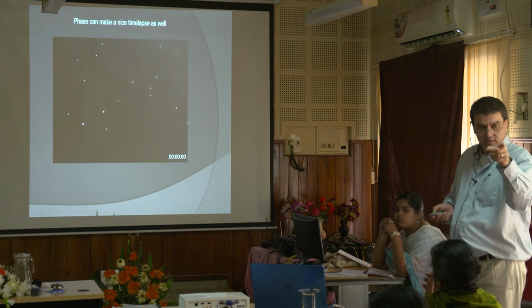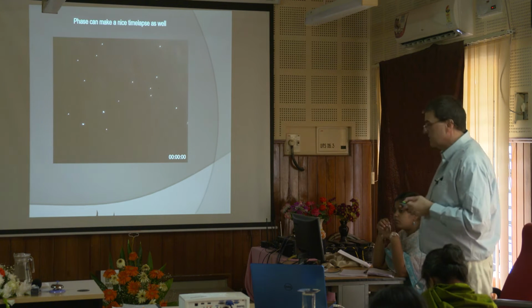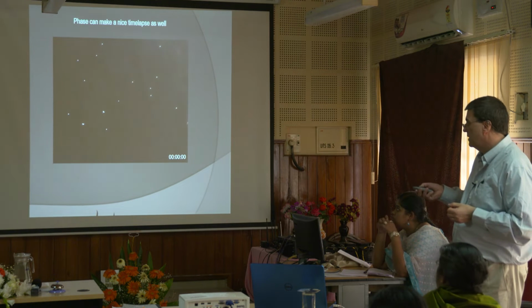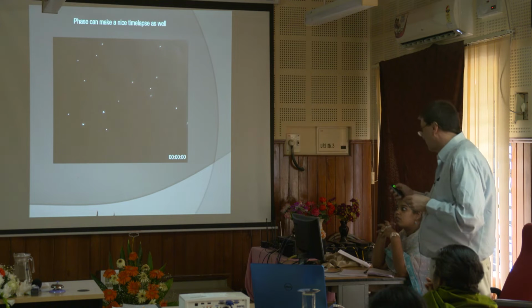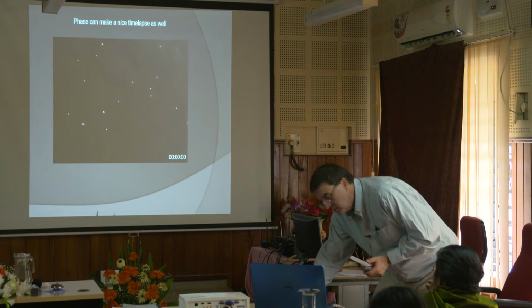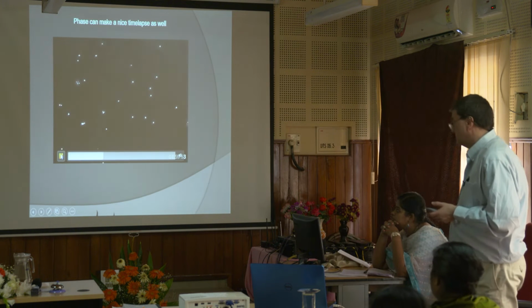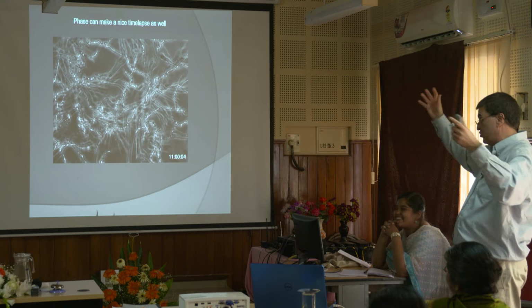Okay, so I work with a lab. You know GNOM, right? GNOM was there when you were there? GNOM's lab? Yeah. So he does fungus, okay? So this was pretty cool, I thought. So I brought this one. I do a lot of this for them. I always try not to contaminate my area, too, because, oh my gosh, it's just fungus going everywhere. But anyway, let's take a look at this. So you can also use time lapse with something like phase. And the hyphae just explodes.